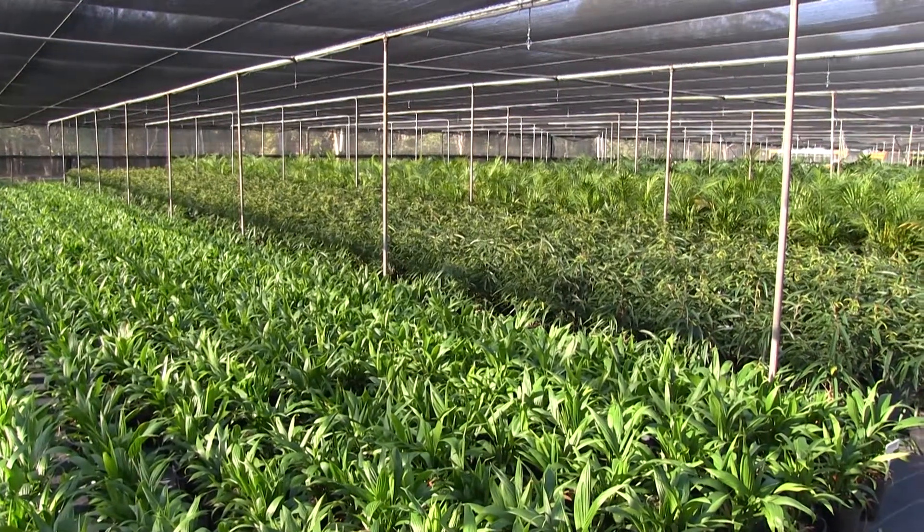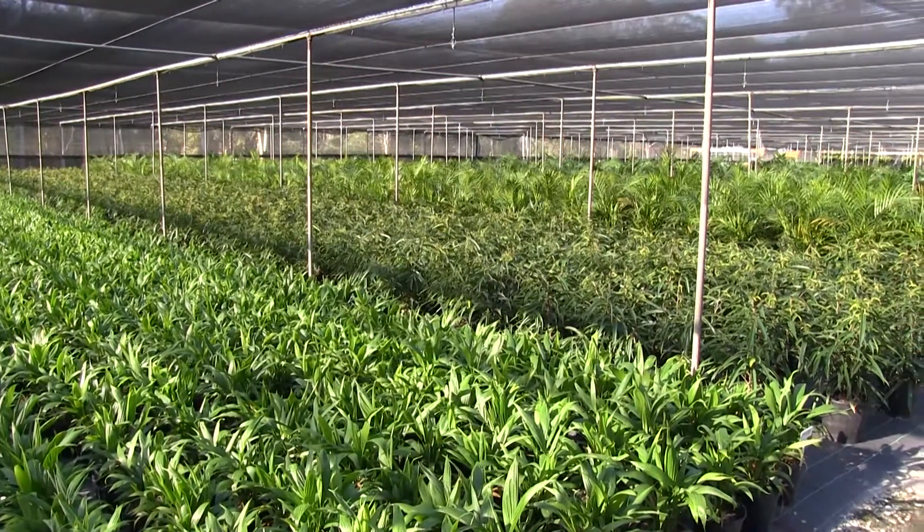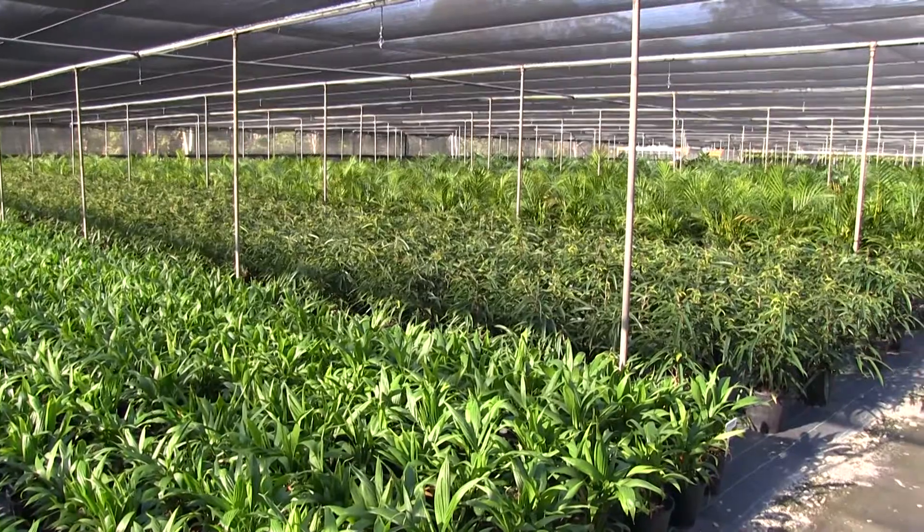The ability of a growing media to take up water effectively once it is dried out is critical to the growth of plants and the ability of media to become wet again. This is known as wetability.